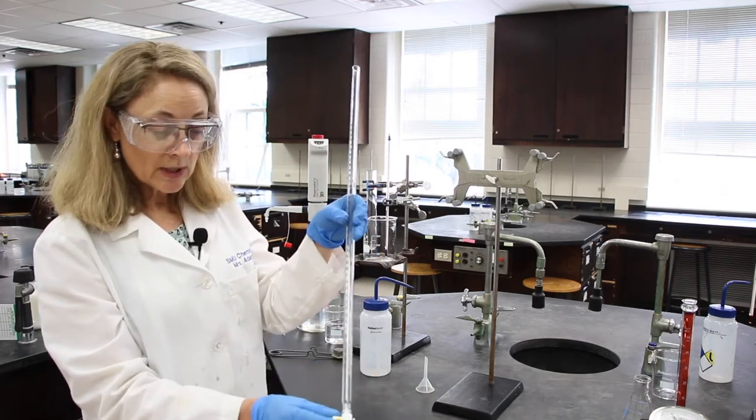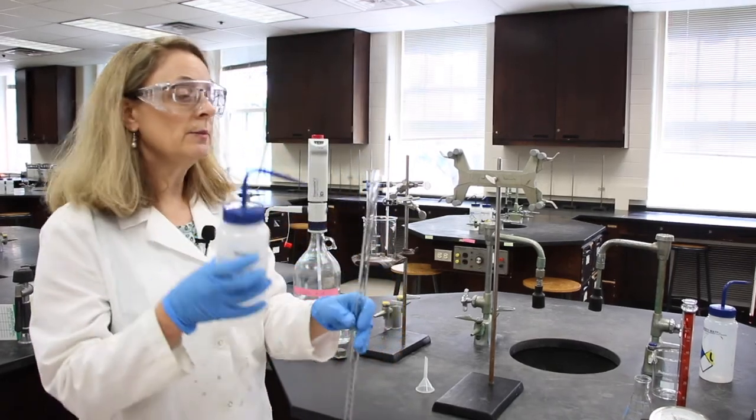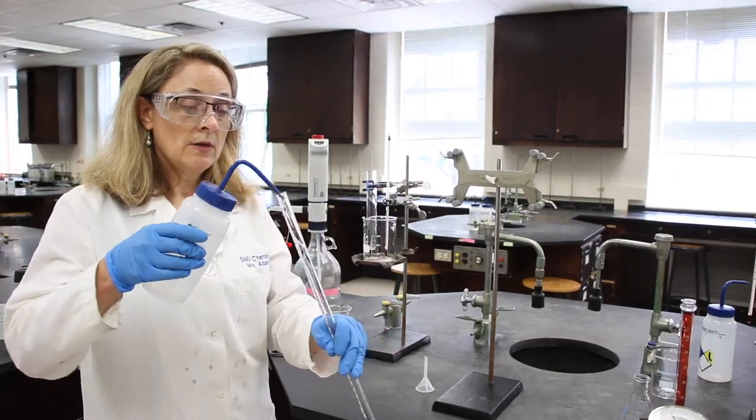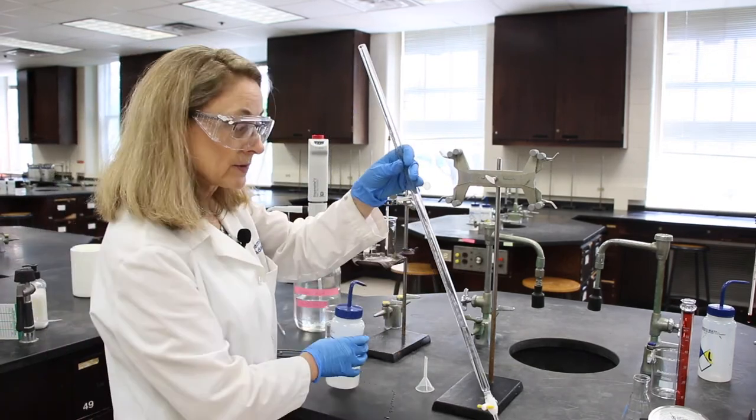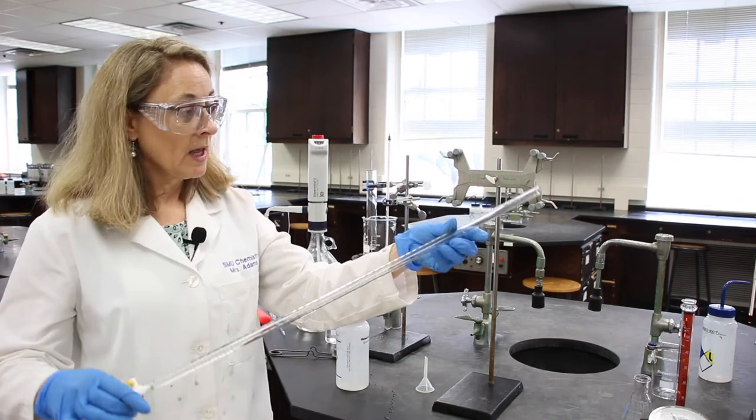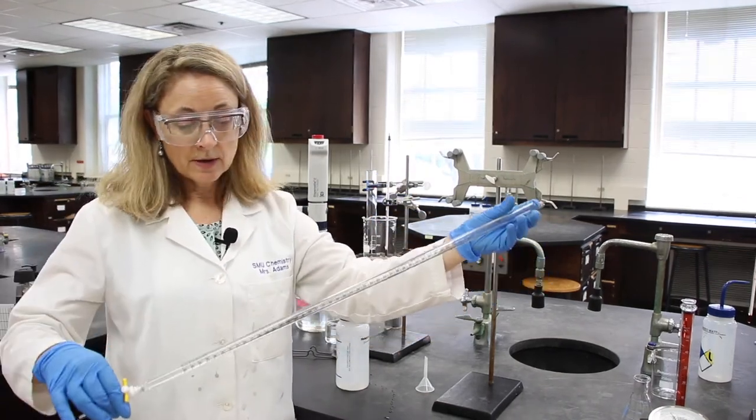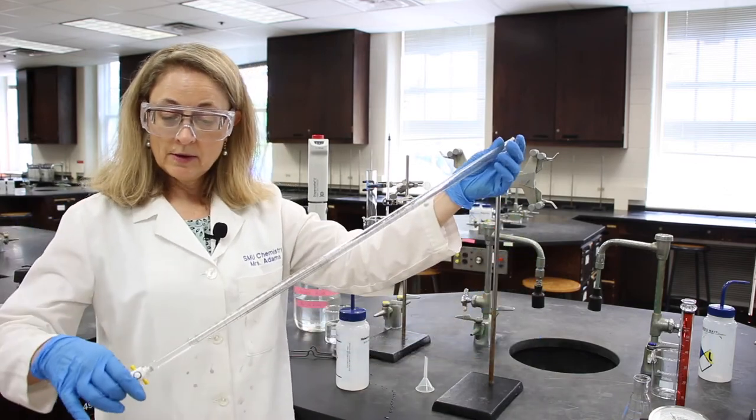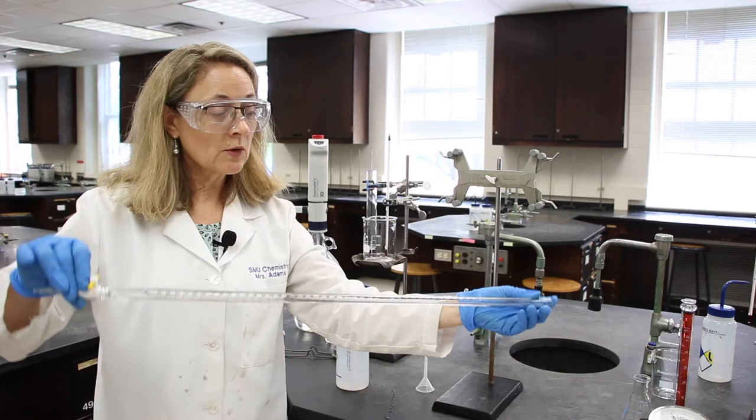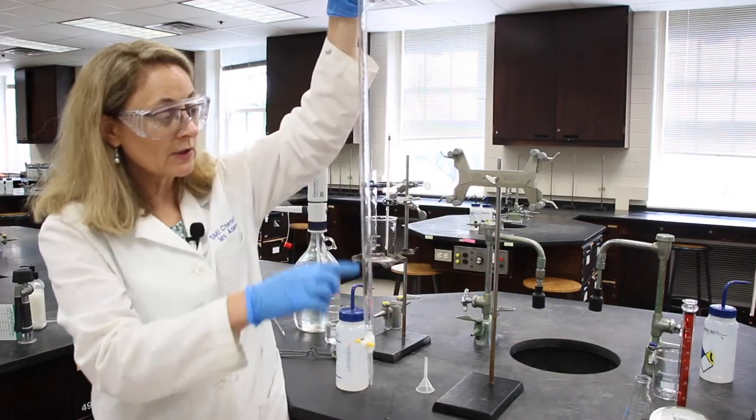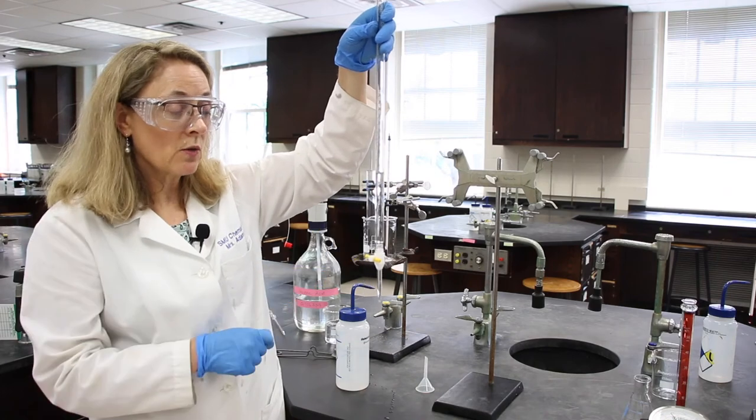So we're going to shut the stopcock off and we're going to add a little bit of the solution that we're going to be using. Maybe five or ten milliliters. The amount is really not important. And you'll want to roll the burette, tipping it all different kinds of ways so that the entire inside surface of that barrel is coated with the solution that we're going to be using.